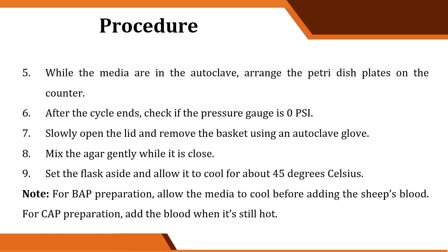So for BAP preparation, gagawa tayo ng blood agar plate. So allow the media to cool before adding the sheep's blood. Okay, so sheep's blood ang ginagamit natin for blood agar plates. For CAP preparation naman, add the blood when it's still hot. Again, ang difference lang nila si BAP at si CAP, yung CAP is hemolyzed na si blood. Okay, kaya mainit pa lang inilalagay na natin para maluto yung dugo.